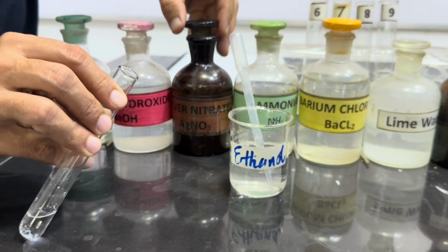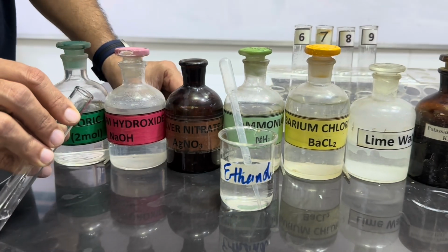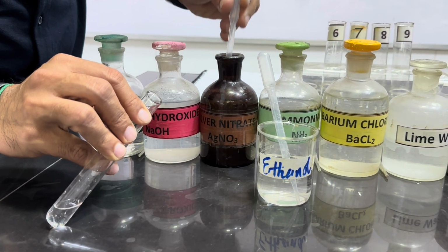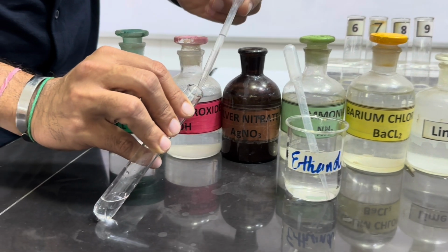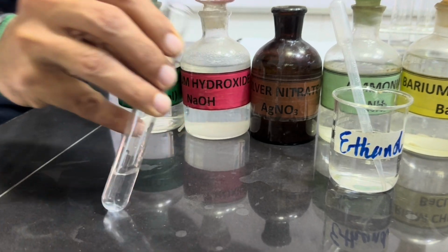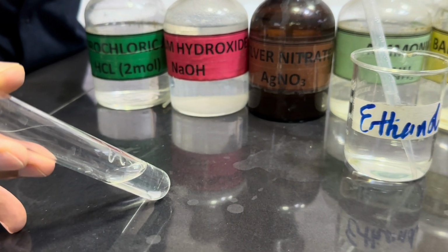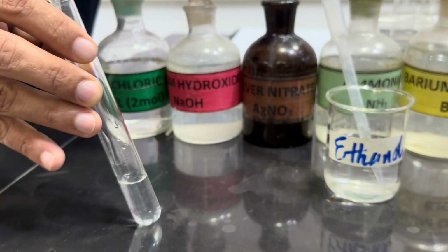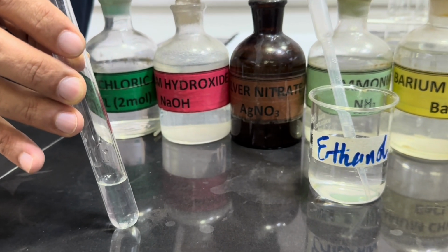We will add silver nitrate, 1 centimeter. So we have added 1 centimeter of silver nitrate, and we can see the color is not changing. The solution is still colorless. So there is no change happening.